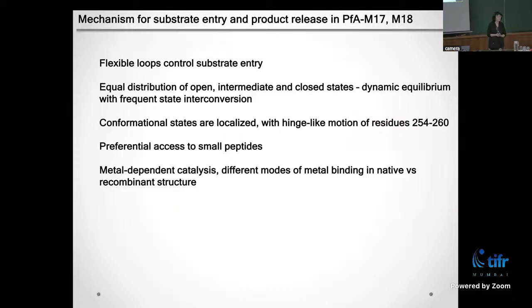The same range. So we have done the MD with both the C1 as well as D3. And therefore, we think, we've done this with the 2.75 as well as with the 3.4. And we are seeing a similar distribution.